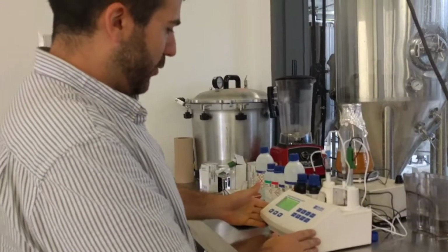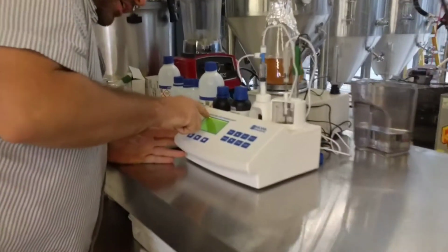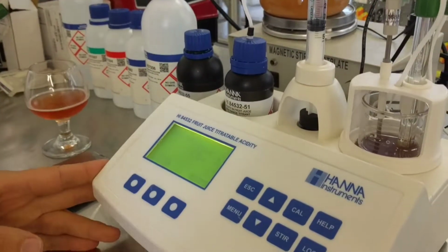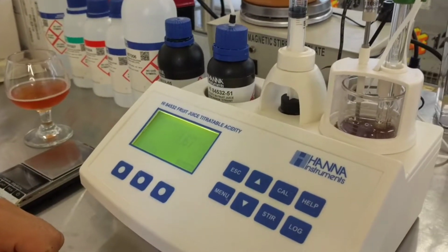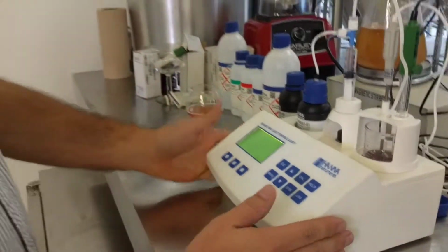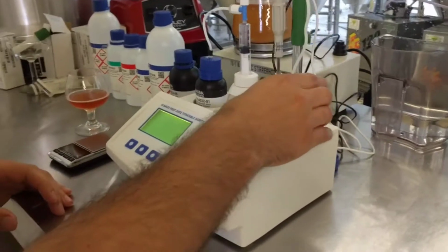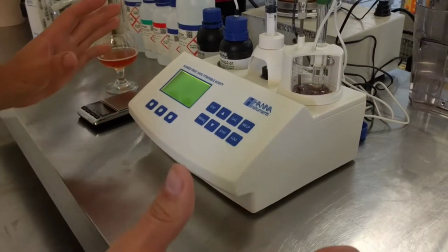We are working with Hanna Instruments number 84532, fruit juice titratable acidity. We're going to go through the calibration procedure today. We're going to show you how to do that. I'm not 100% sure how to do it, but we'll walk through it together.